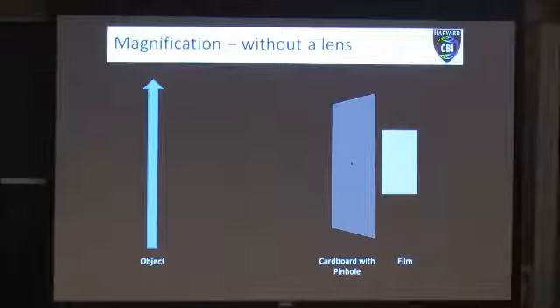It's coming from all the lights around the room here. If you got the shades open, there's light coming in from the windows. So all that light is coming in from many different directions, hitting this object, and then it's going to bounce off, right? Okay. And it's going to bounce off in all directions. So if we just look at the very, very tip of this object, and we want to see where that tip shows up on our film, how do we trace that out?